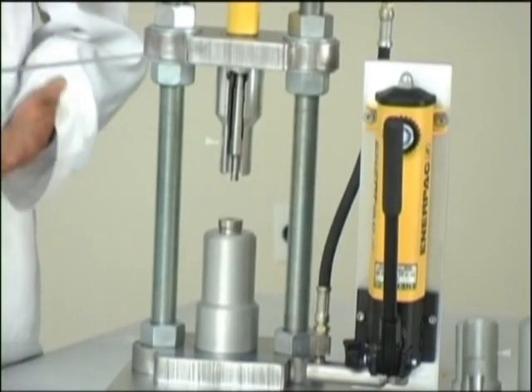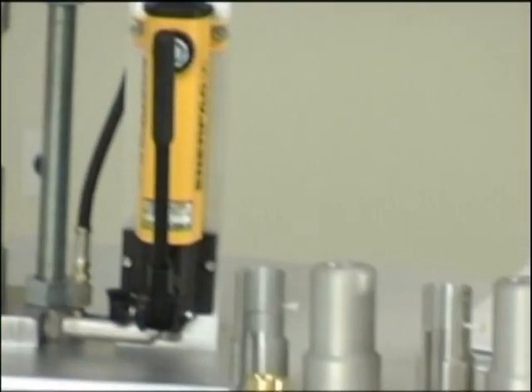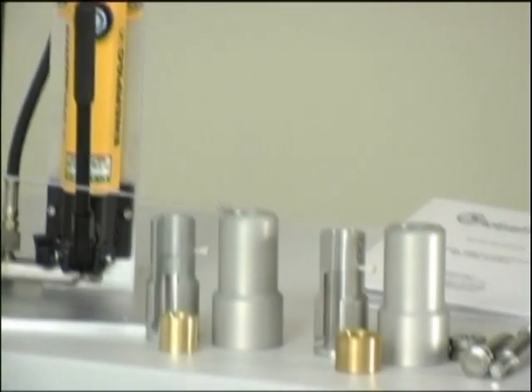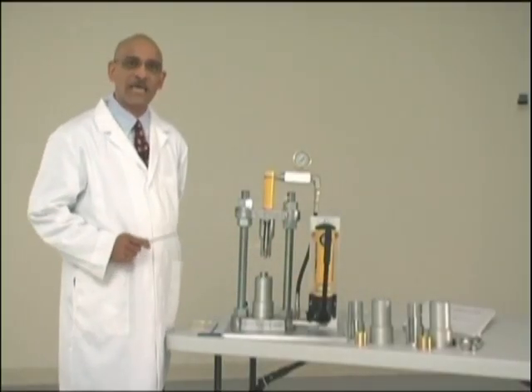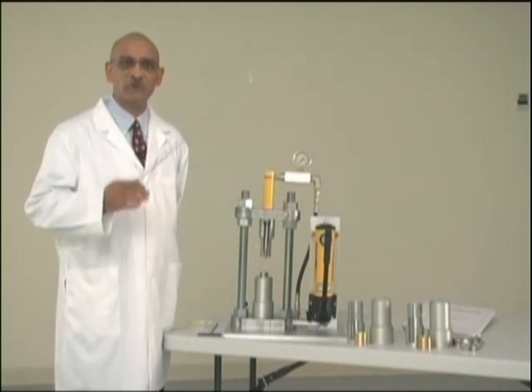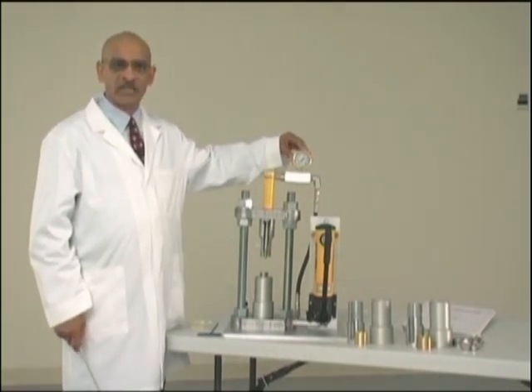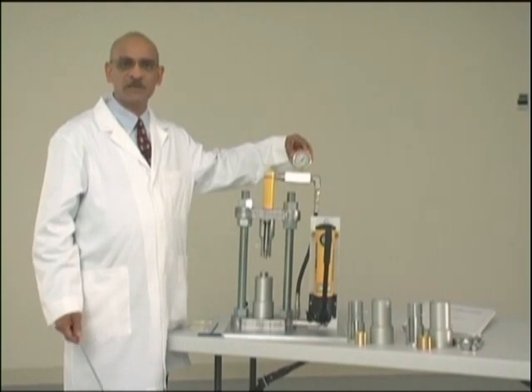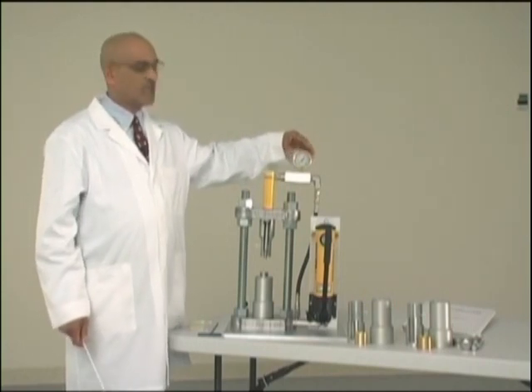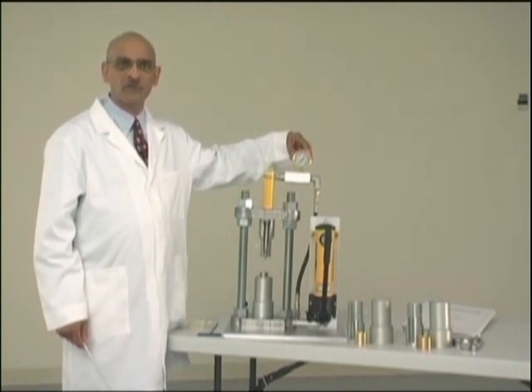The gauge is calibrated against an NIST certified load cell and the calibration curve is provided in the instruction manual. There are three sets of upper punch holders that can come with the machine: punch holders B, punch holders D, and punch holders DS. The punch holders help align the punches properly during compaction.